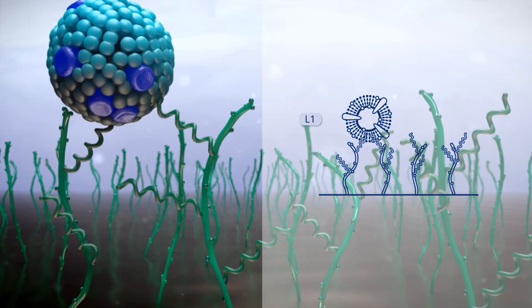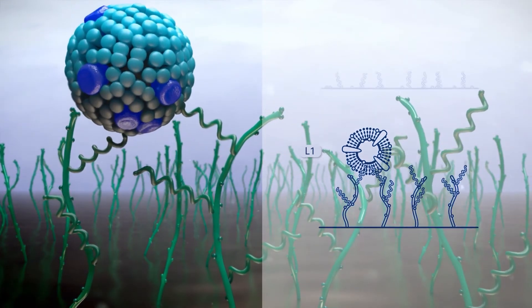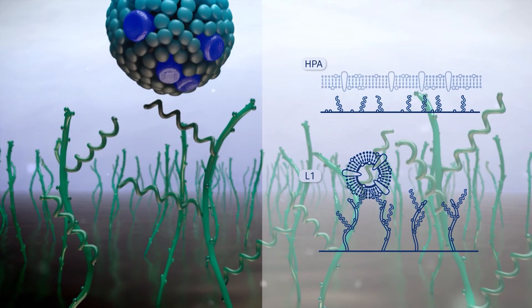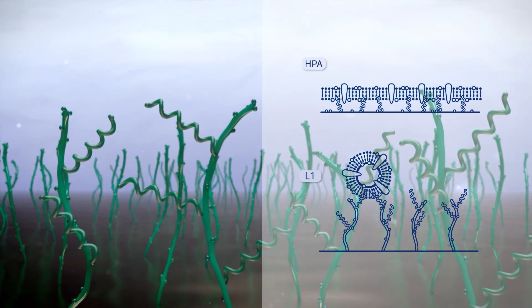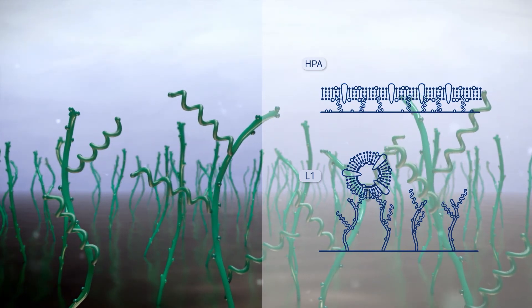Ligands are held in the lipid bilayer or membrane vesicle. On the HPA surface, lipid monolayers are coated onto the chip directly to study interactions with membrane-binding molecules.